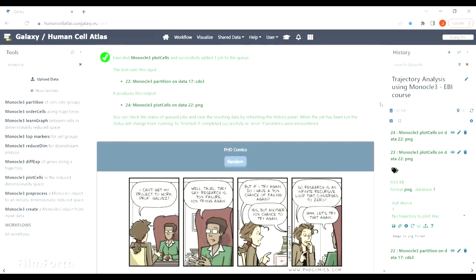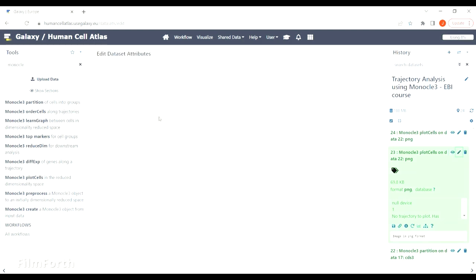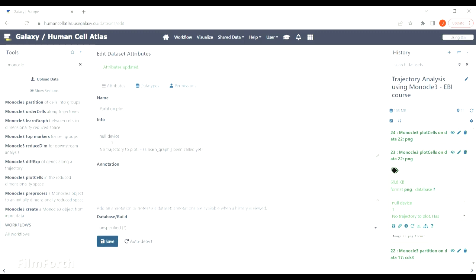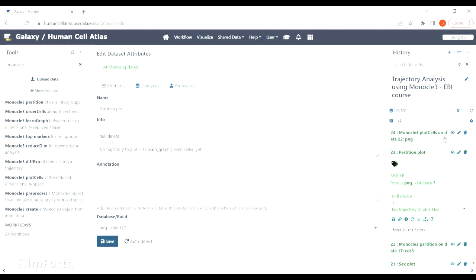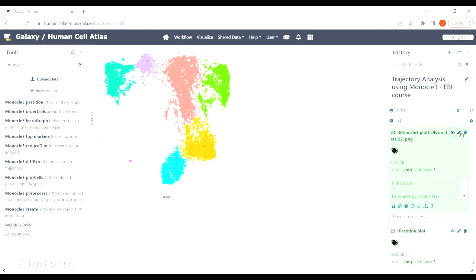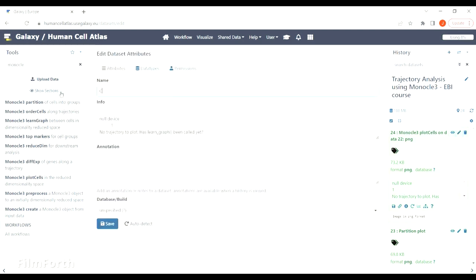You can see the output here. Almost all the cells were assigned to one partition, which is what we wanted to obtain. Also, the clusters correspond nicely with different cell types that we have in our dataset.